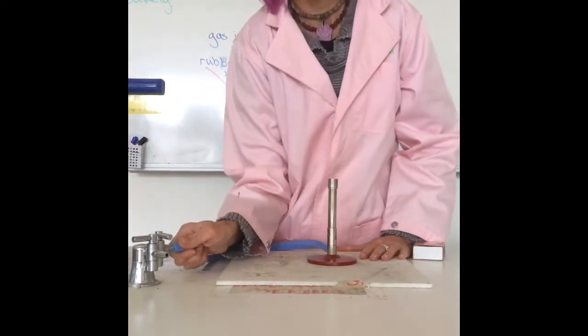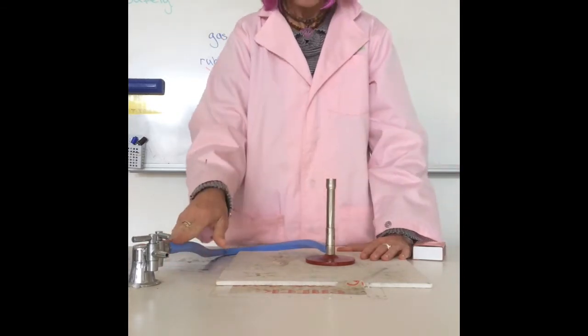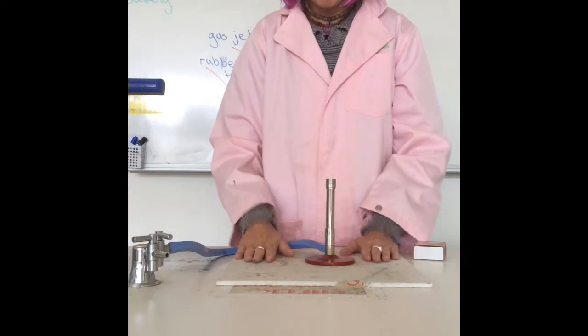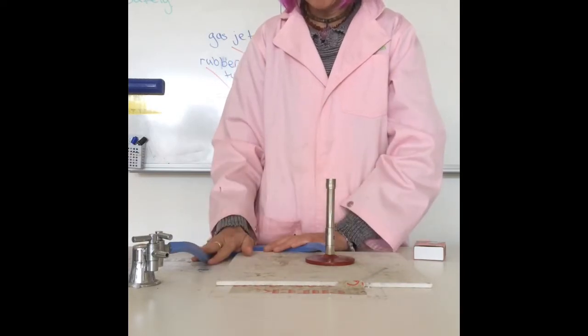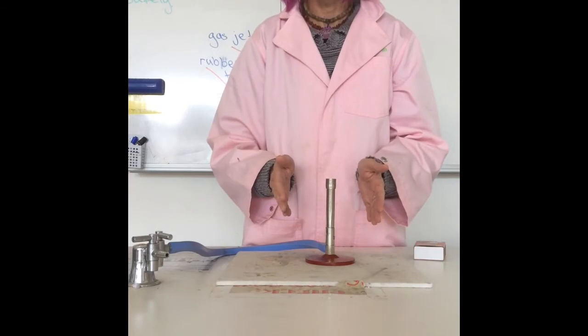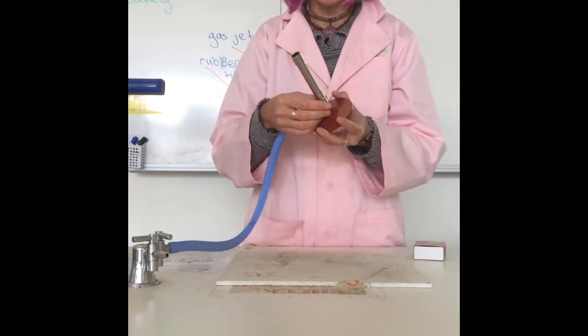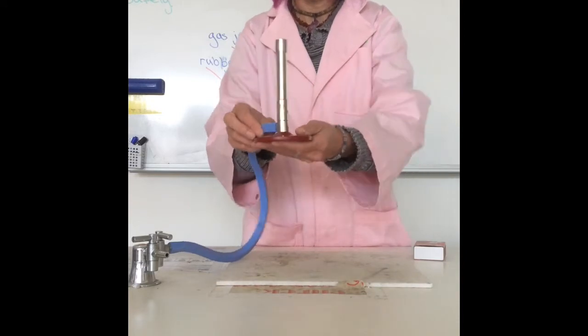You can now put your Bunsen burner on the heatproof mat and plug it into the gas tap closest to you. So, heatproof mat, I've checked for cracks in the rubber tubing. What do I have to do next? That's right. I need to check to make sure the air hole is closed. So the air hole is now closed.